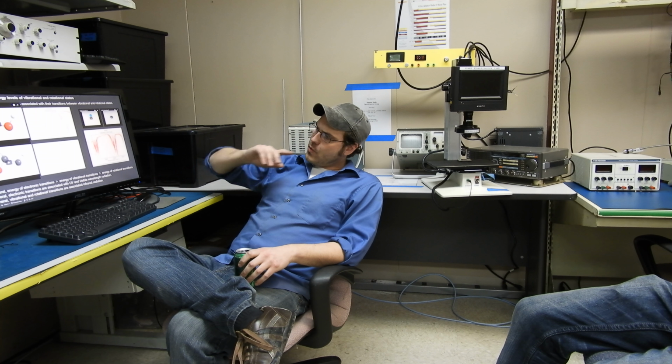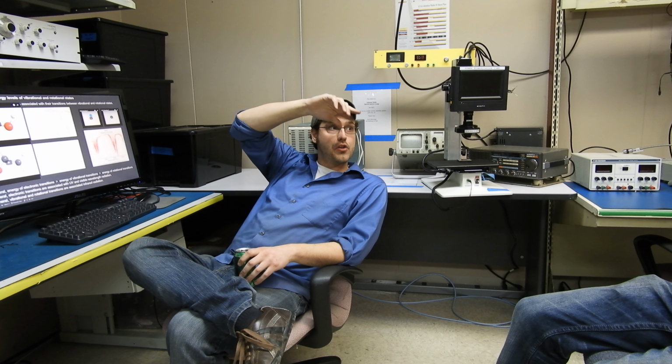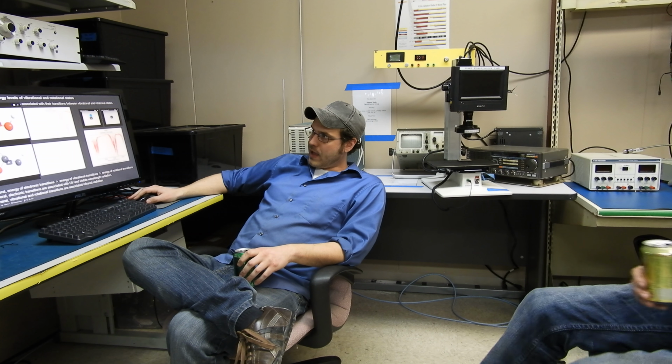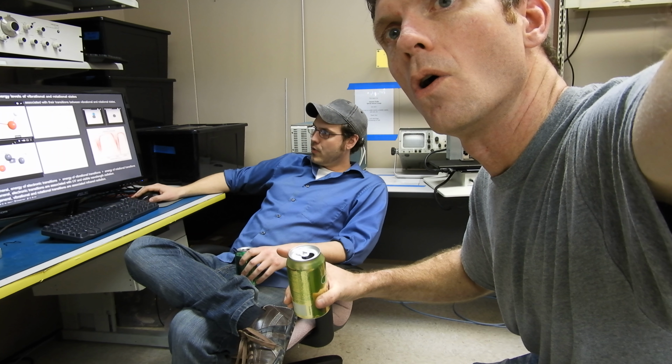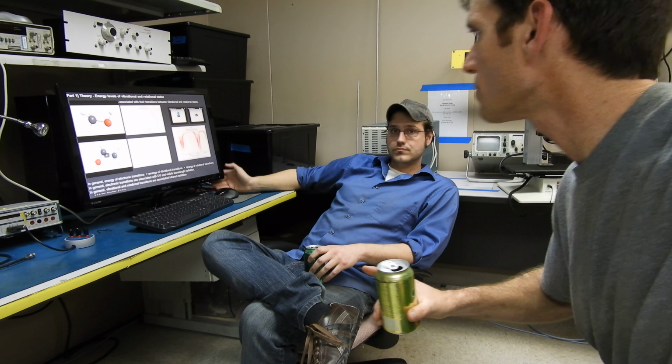Just like we saw on the previous slide with the electronic transitions, molecules also have vibrational and rotational transitions between states. Here we have the vibration of a methanol molecule. It is 4K, so we'll catch most of it there.